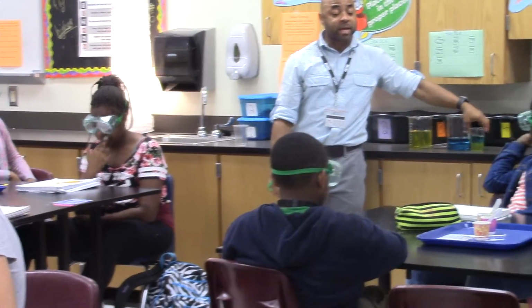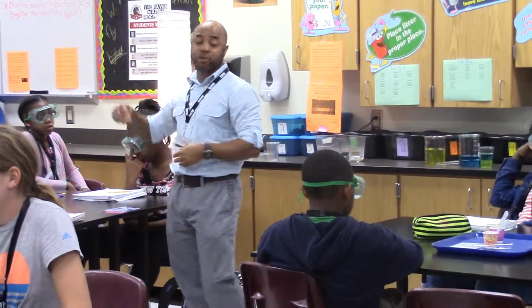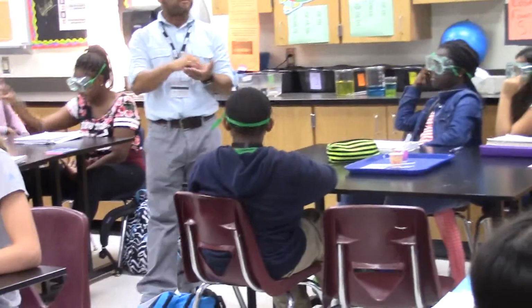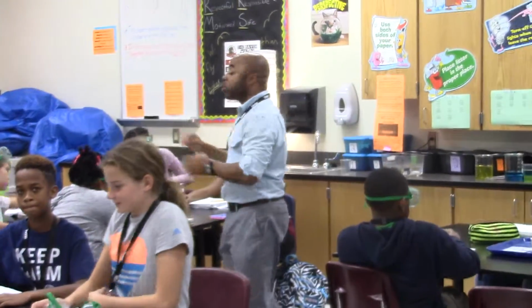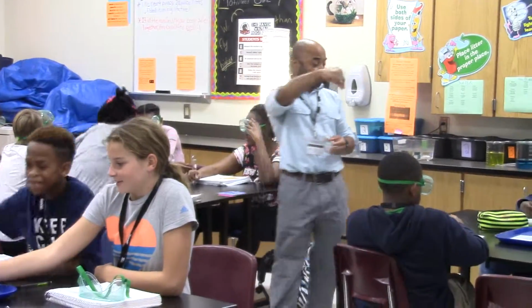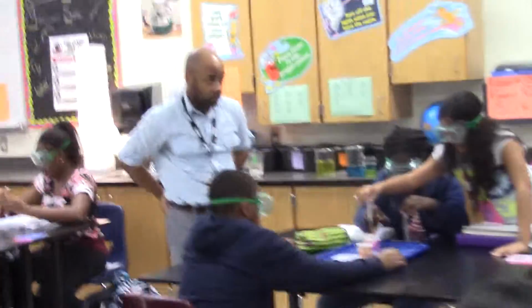So take a few minutes, figure out who's going to drop what in the test tube. I'll let you work on it as a group. Everybody should have a chance to participate. Once you have figured that out, go ahead and get started. Start putting it in. Put it in the order you said it was going to be, and try to put it in the middle, right?